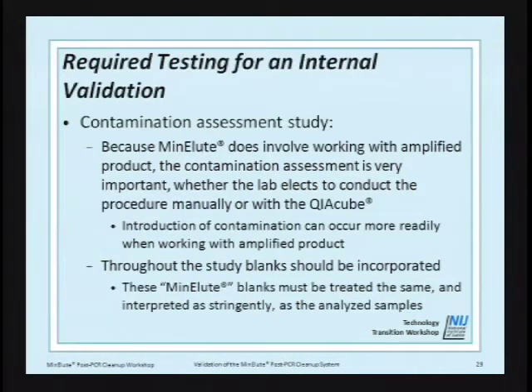One thing I'll say about the manual process: when we've done training, I've had a lot of trainees, students, people who are DNA analysts in training to become DNA analysts, do this process for the first time, and we've never seen any contamination. When you all do it, you'll see it's a very easy process. Once you bind your DNA to that membrane, there really isn't any way to get the DNA off of it unless you're going to put liquid in it and pour it on top of your hand or something to get the DNA to come off the membrane into your hand.